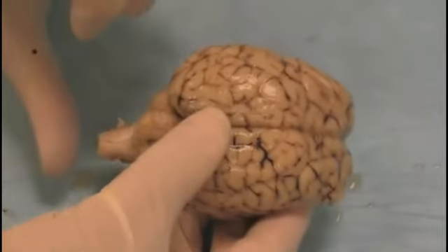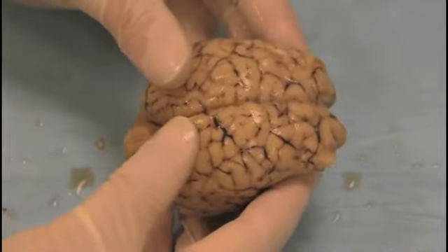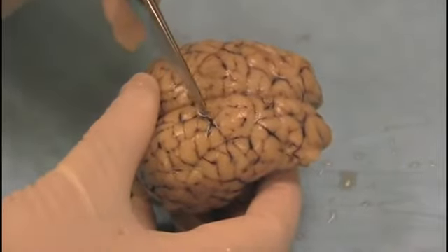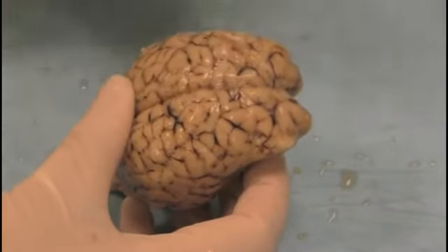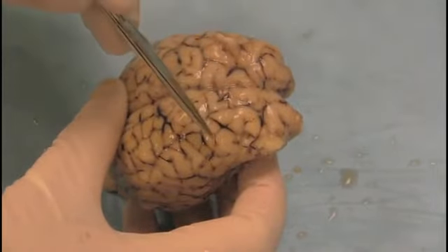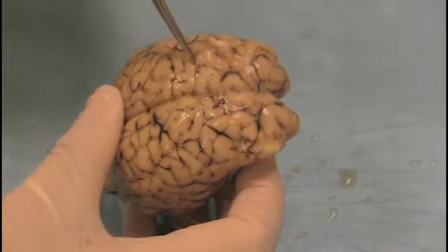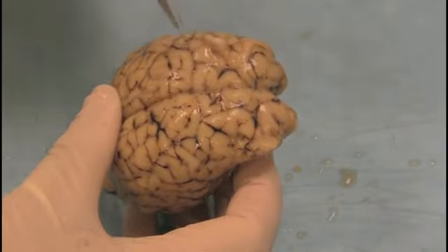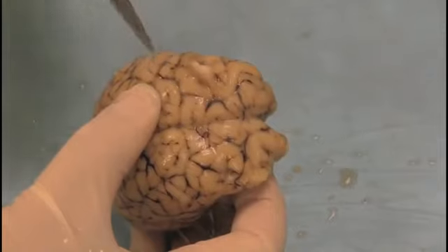Rostral end, caudal end, spinal cord. You can see that the brain is divided into two hemispheres, and we can see the blood vessels on the surface — they're black. Looking at the surface of each hemisphere, we can see numerous hills and valleys. The hills are called gyri, and the valleys or fissures between them are called sulci.